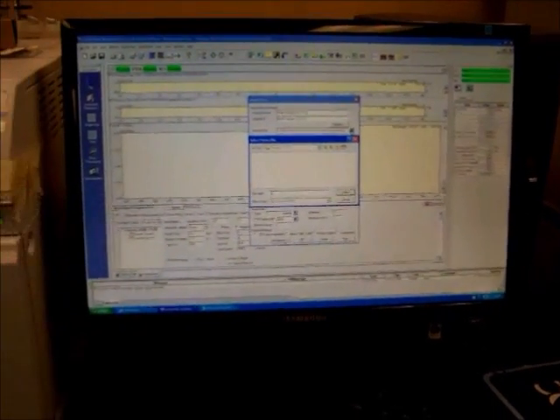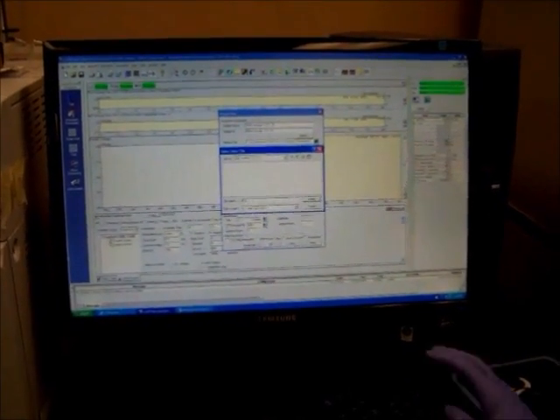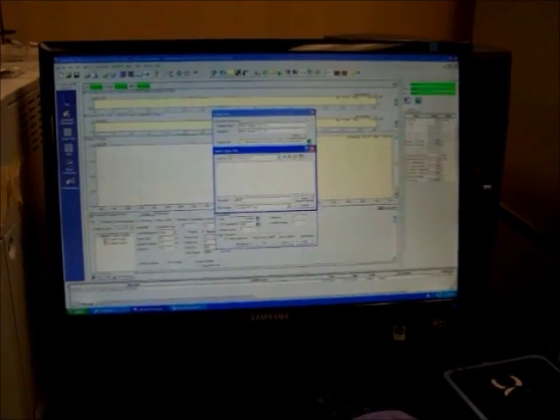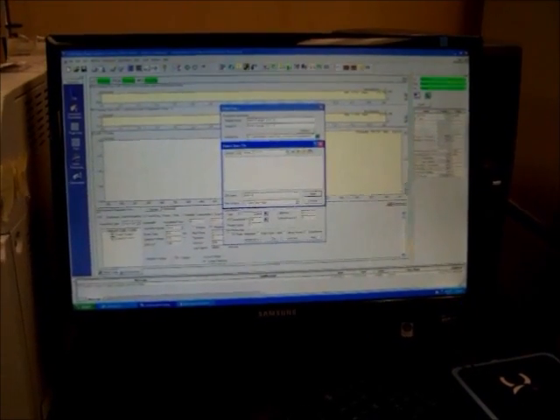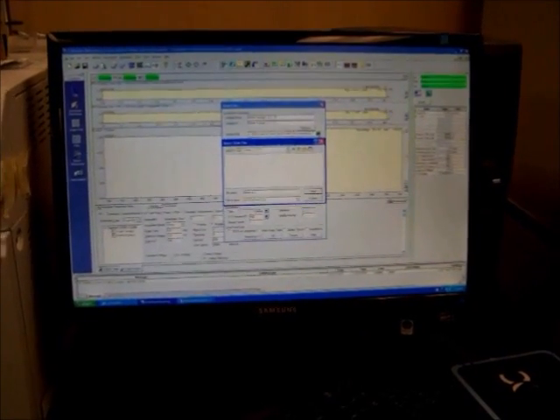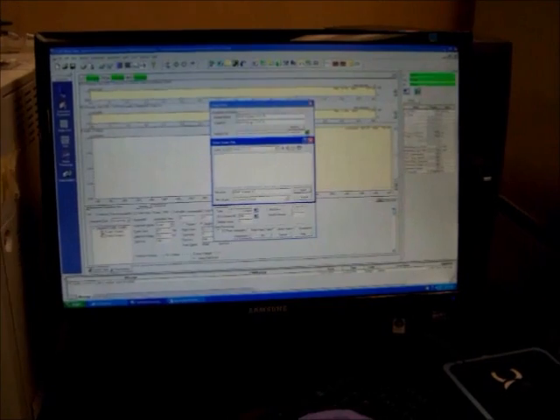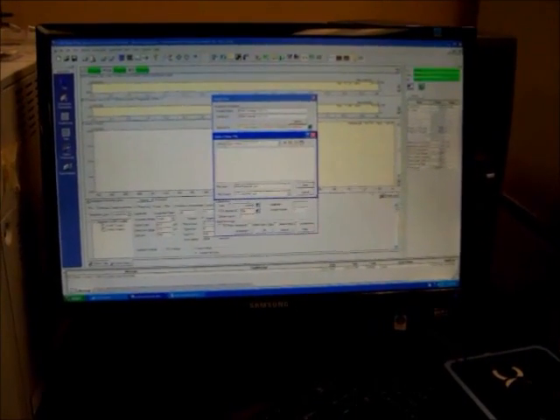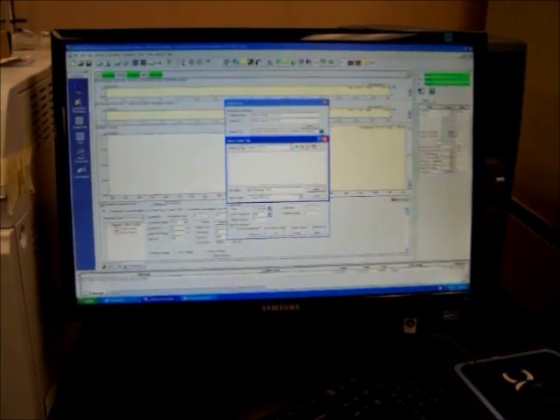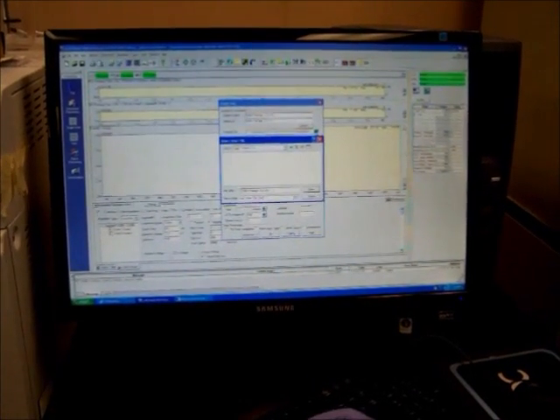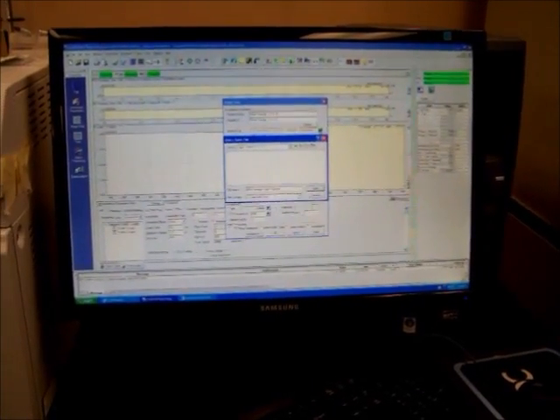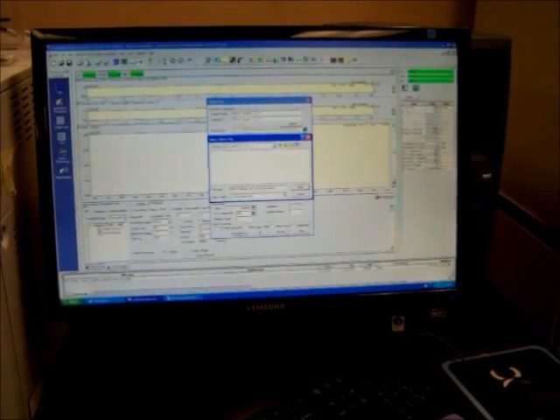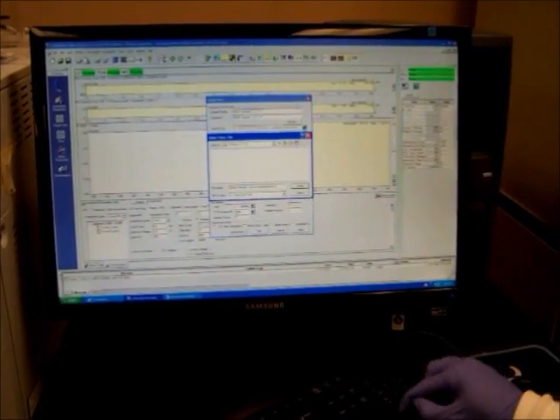So what we're going to say in here, our specific data file, we're going to say the 60 micromolars Naringin test for demonstration. Try to be as specific as possible.